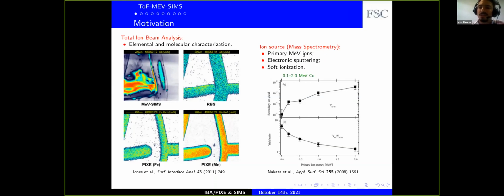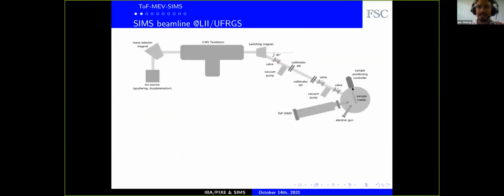When we use such high fluences of ions to do the measurements, we are indeed changing the spectra very fast. And we are breaking up the molecules into, let's say, relatively low fragments. But then, of course, this is our motivation. We would like to go as much as possible to the highest energy deposition that we can do in our lab. So we have a Tandetron system.